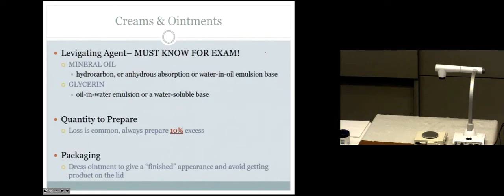When you're all done, you need to clean the ointment jar, which means, is the ointment supposed to go on the inside of the jar or the outside of the jar? Some of you, it all slips out of your hand as soon as you pick it up. So make sure it's nice and dry on the outside. There's no slimy stuff on it.